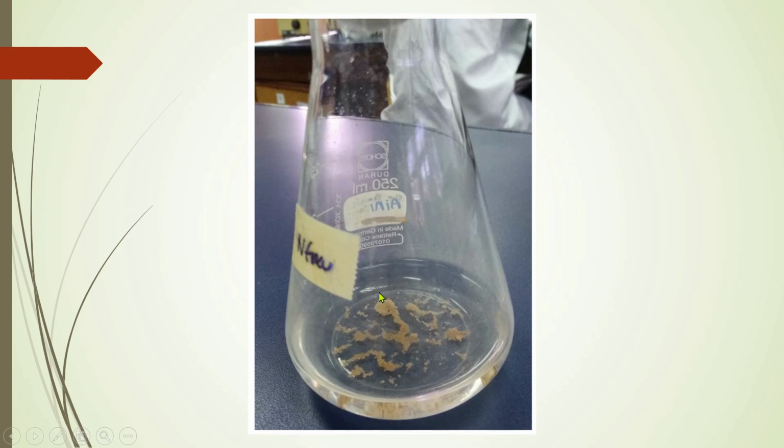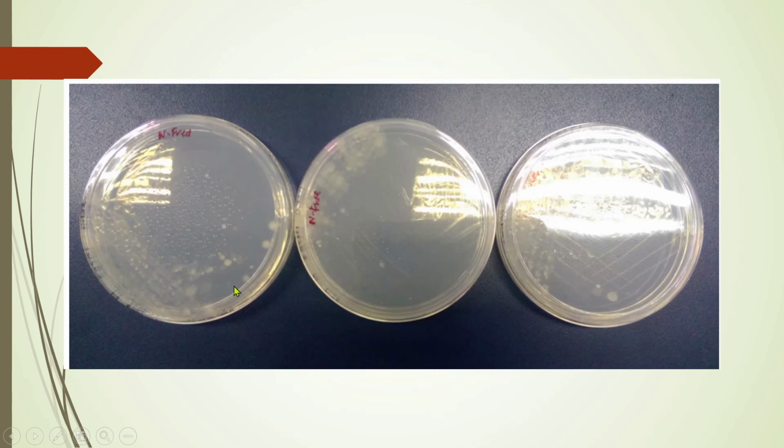This N-free medium has already been inoculated with surface soil. Then after 2 weeks, dilution streaking of the N-free broth reveals mucoid microorganisms growing. The plates used here are also nitrogen-free plates.